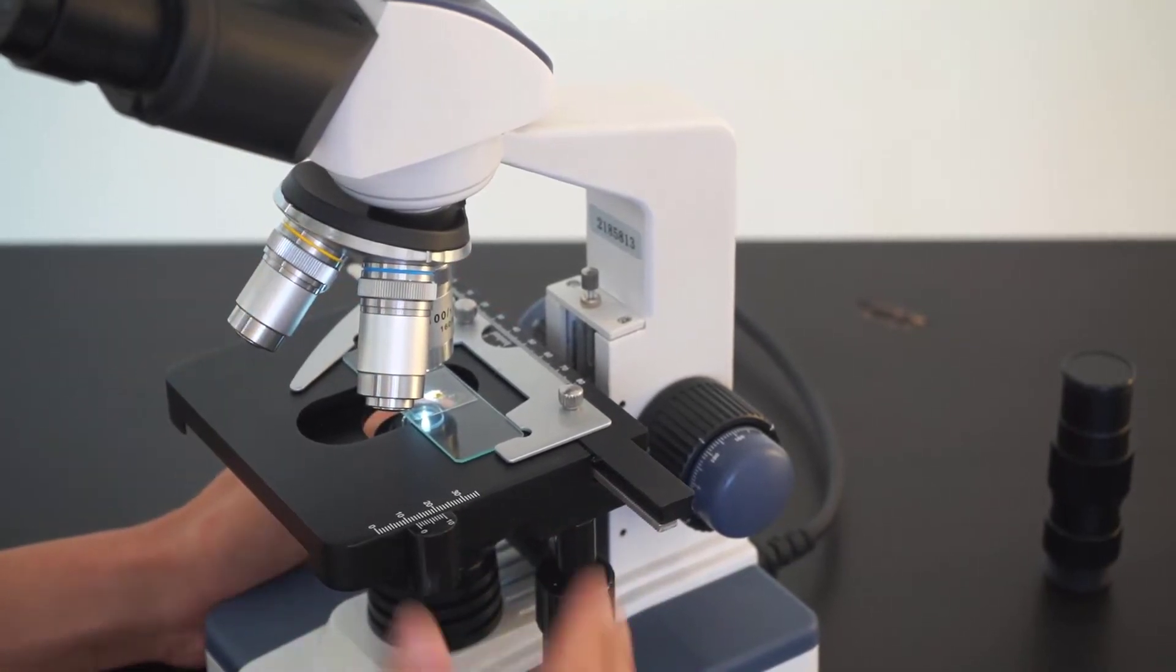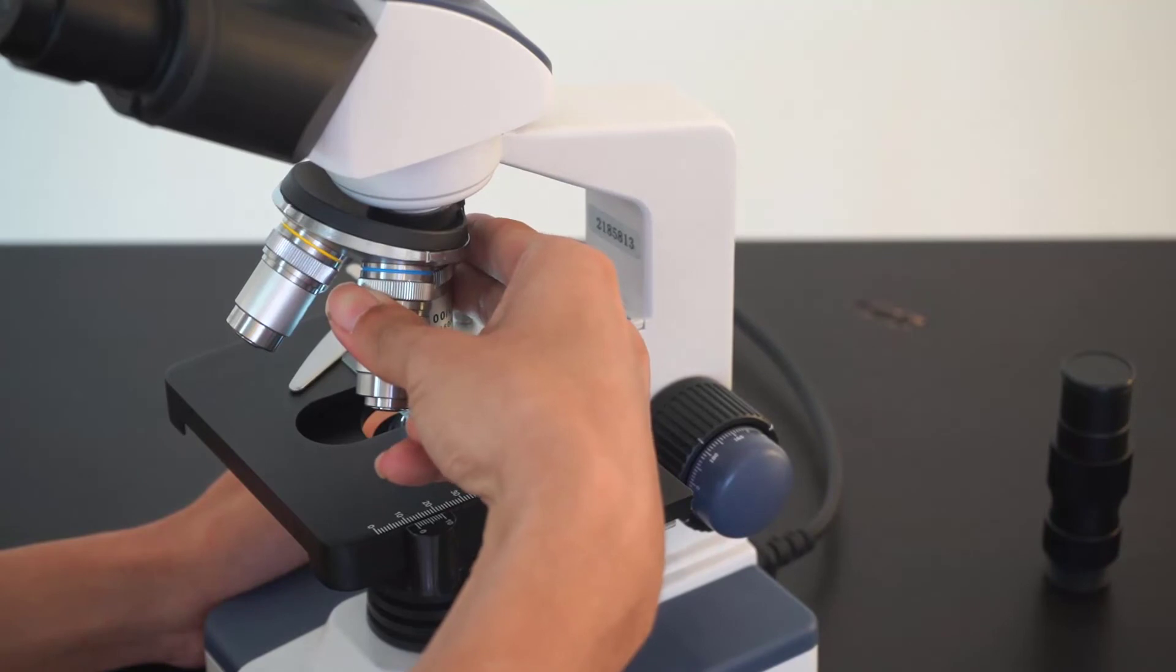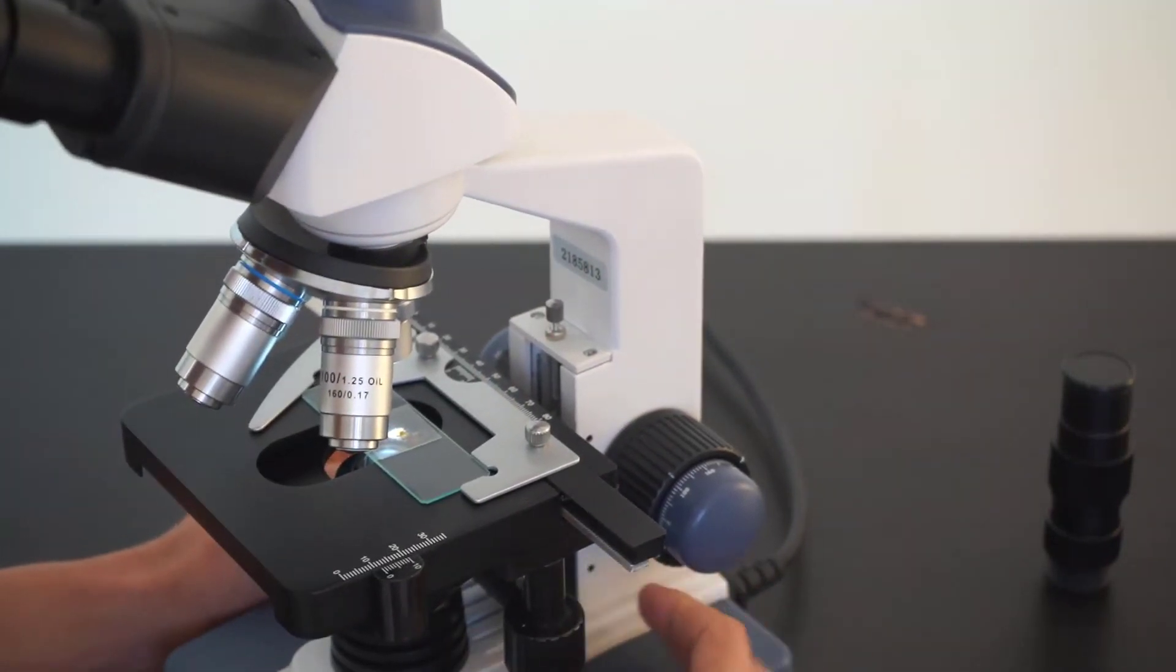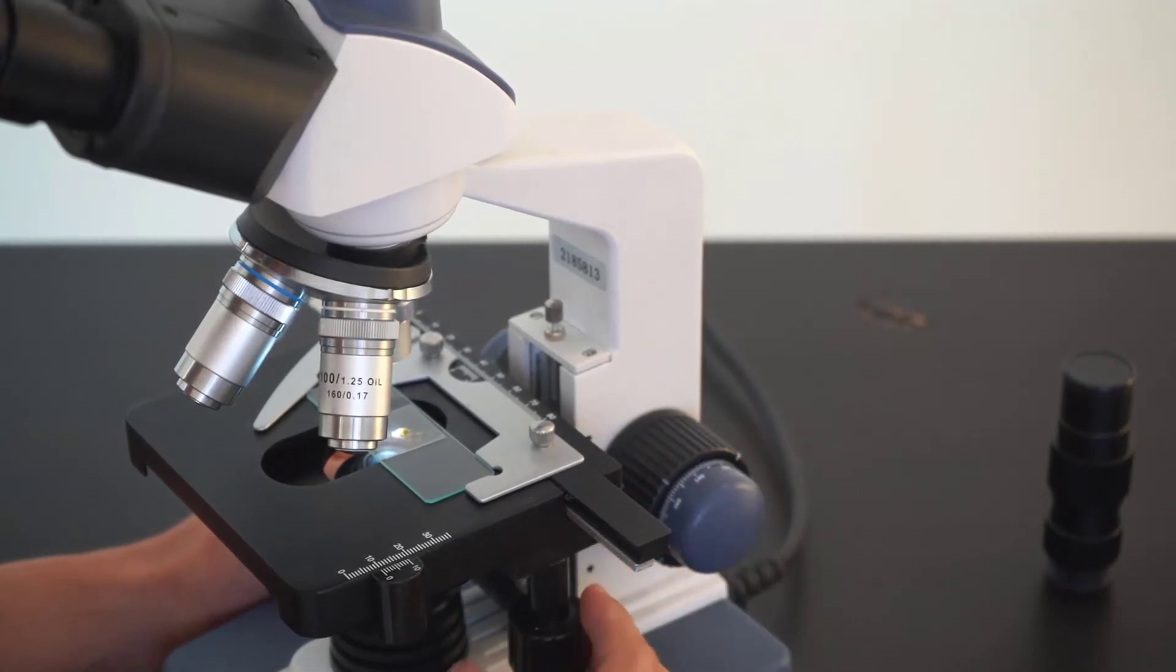Generally, it's better if you start with a lower magnification and get your focusing right.